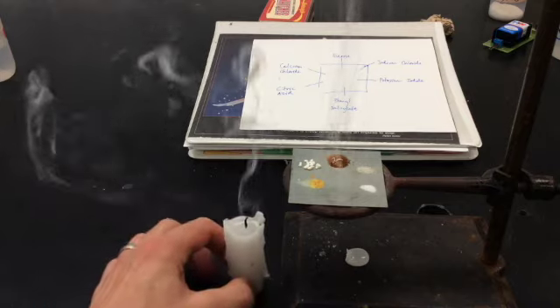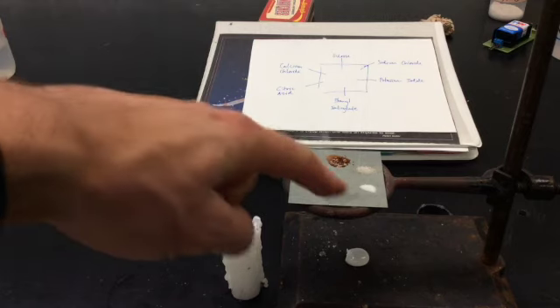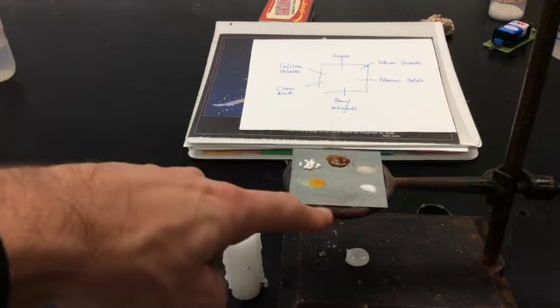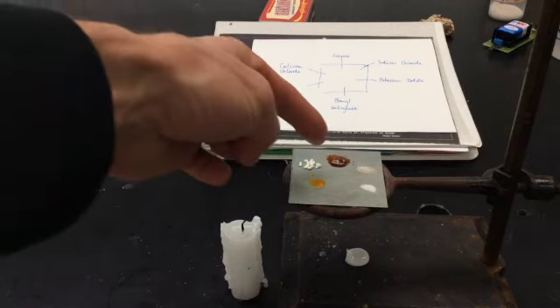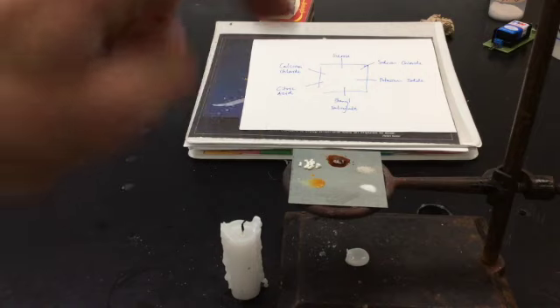So we're not going to see any other significant changes. So one last observation to note here. Again, our phenyl salicylate melted first, then the citric acid, then the sucrose. But our calcium chloride, our potassium iodide, and our sodium chloride did not melt.